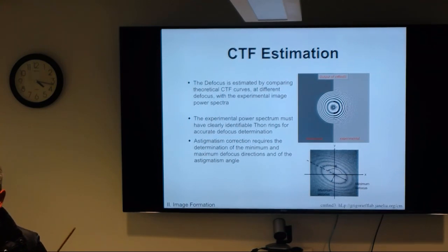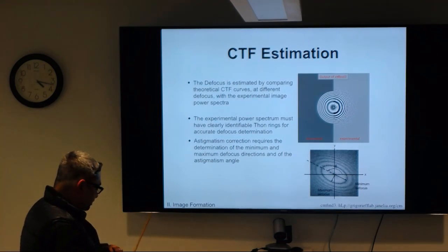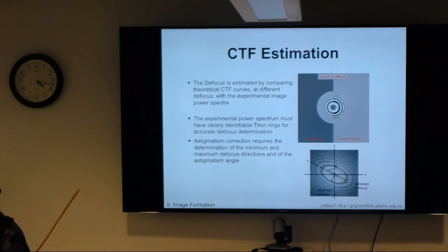You also give it a resolution range to search for. You give it a low resolution cutoff and a high resolution cutoff, and it fits only between those values. So it may fit better than that. Yeah, it searches in a certain region, within a certain part of the spectrum. Alright.